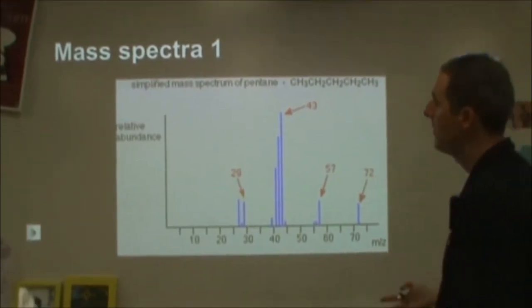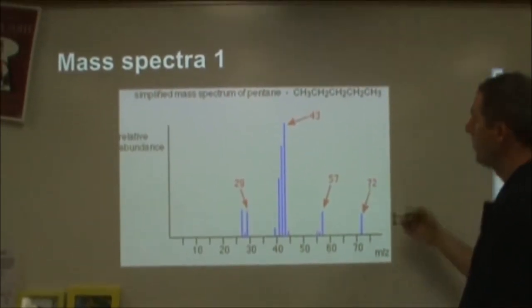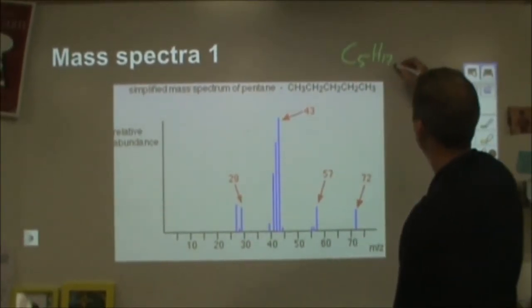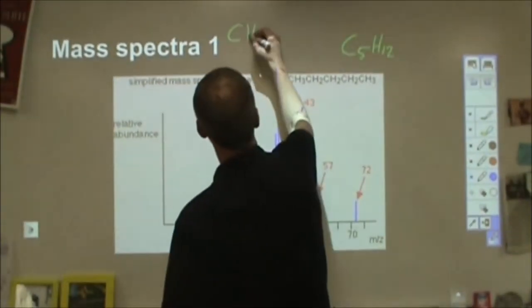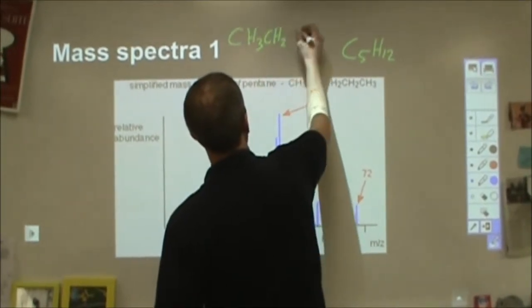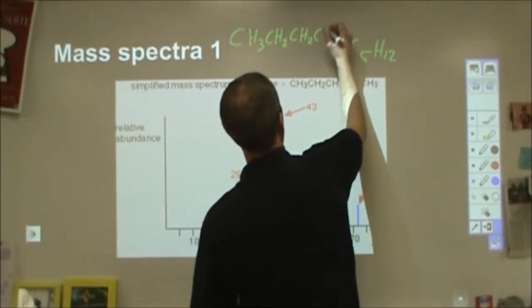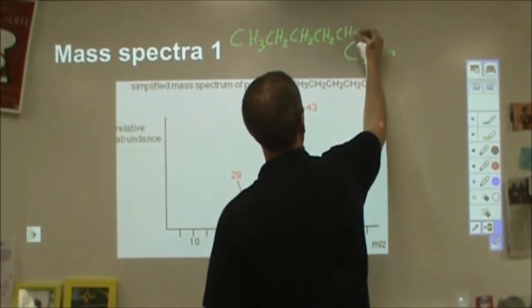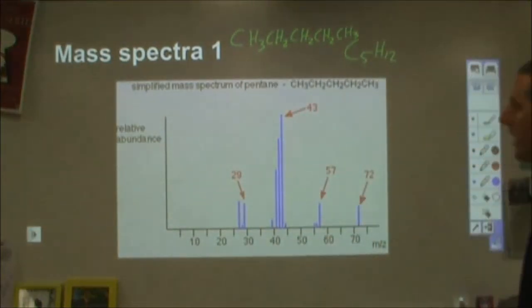So this is a mass spectra for pentane, which is C5H12, which is straight-chained alkane. So we have CH3, CH2, CH2, CH2, CH3.